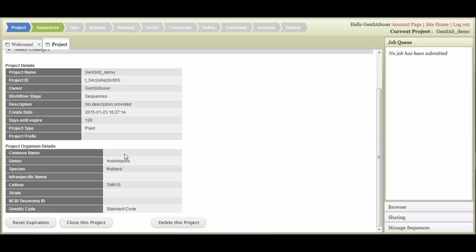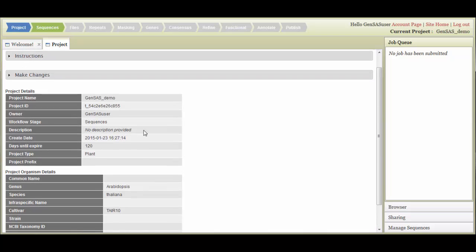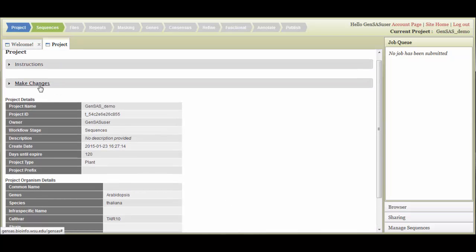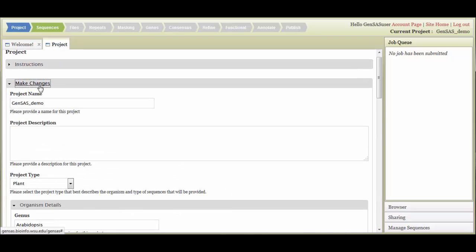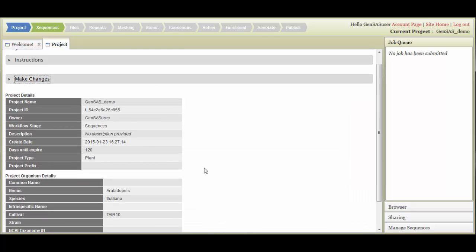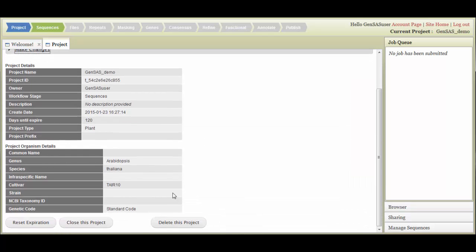If you would like to make changes to your project, please click on the Make Changes section. If you want to switch between GenSaaS projects, you need to click the Close this Project button, and you will be taken back to the Original Project tab where you will have the option of starting a new project or opening an existing project.